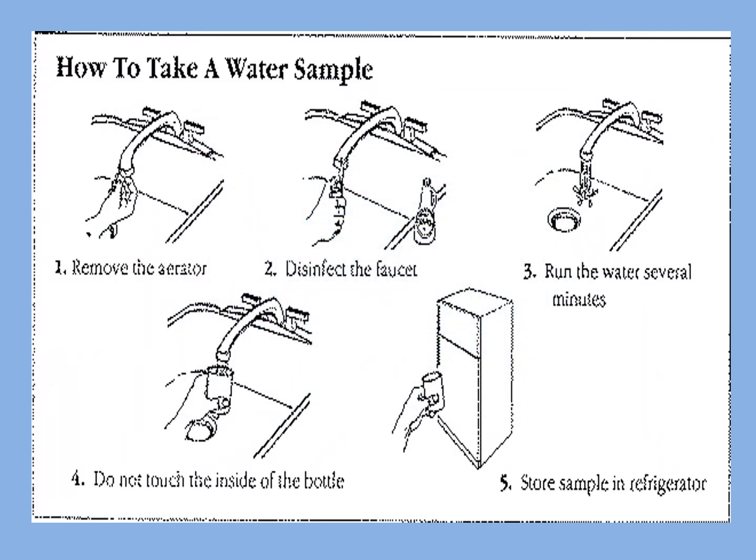This is how to collect a water sample. Select the tap, remove the aerator, disinfect the faucet, and run the water for several minutes. Then open the container, collect the water sample, and refrigerate it or send it to the laboratory for testing.